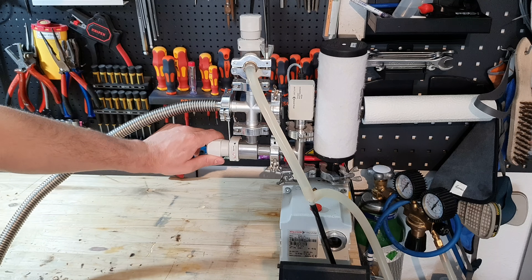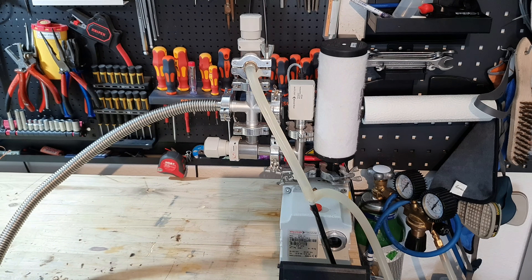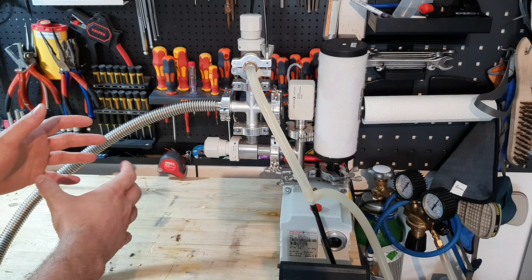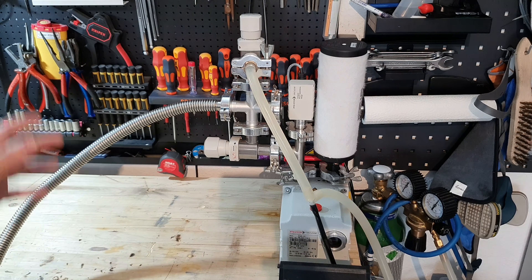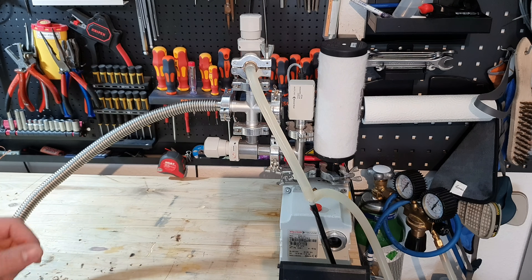Next I opened the vacuum valve to pull a vacuum on the system. Then I used a heat gun with a tube of aluminum foil around my vial and heated the vial at 250 degrees Celsius for one hour to desorb any moisture at the surface of the glass. After I did that, I started the distillation. And from the distillation I have some awesome footage, so let's get on with the video.